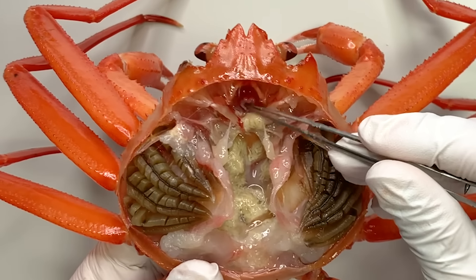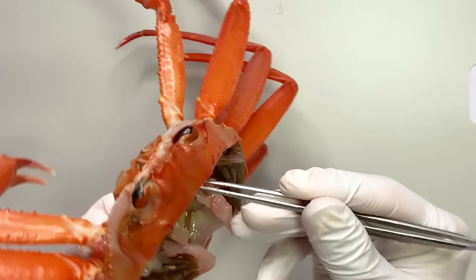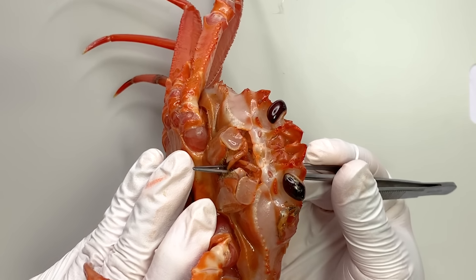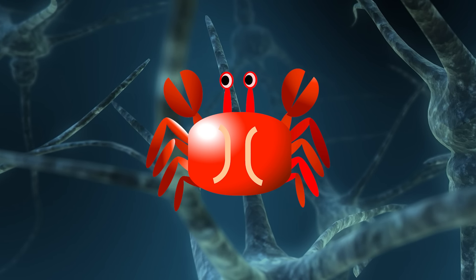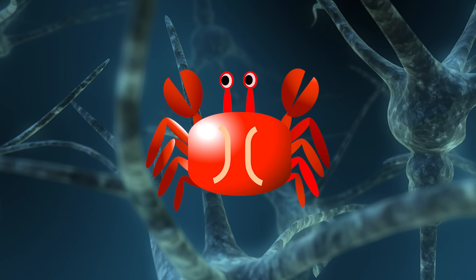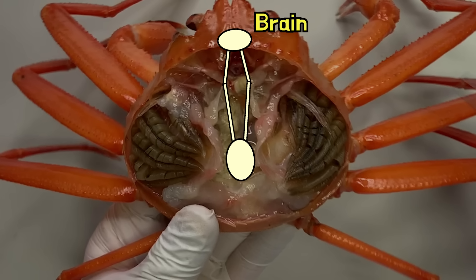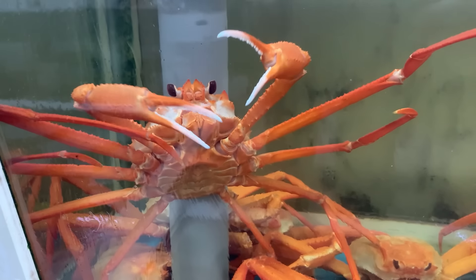After removing the stomach, you can see the esophageal opening. This opening confirms its connection to the mouth. Finally, the crab's nervous system is transparent and difficult to observe, but the brain is located above the esophagus. The nerves spread from the middle of the body to the legs, controlling the crab's movements.